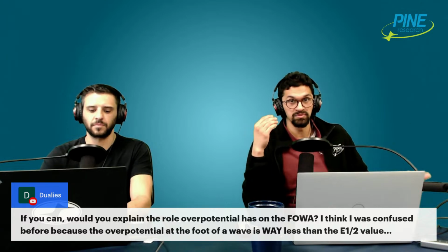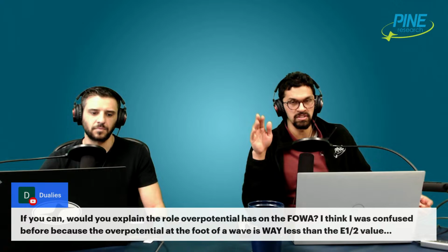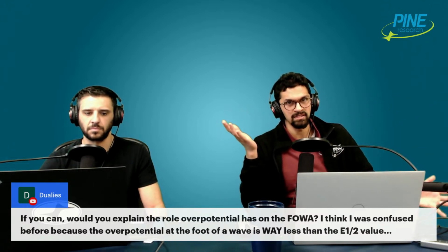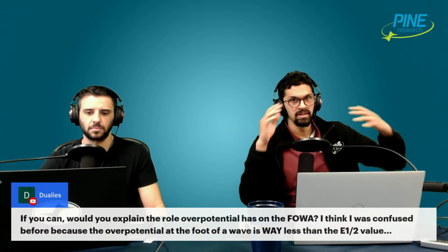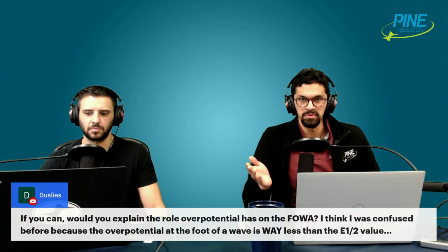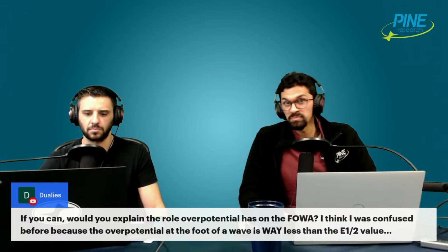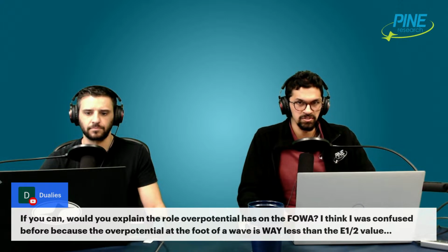That's why the potential where the foot of the wave analysis occurs is much farther away. And how much farther away depends on the kinetics of your system. If your rate constant's very slow, it's going to be super, super far away. But if it's very fast, like in Neil's example with ruthenium hexamine, it was maybe 50, 100 millivolts away. That's it. But it could be a lot farther away if your rate constant is slow.